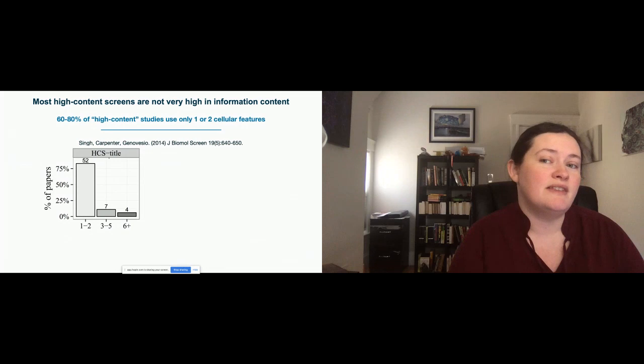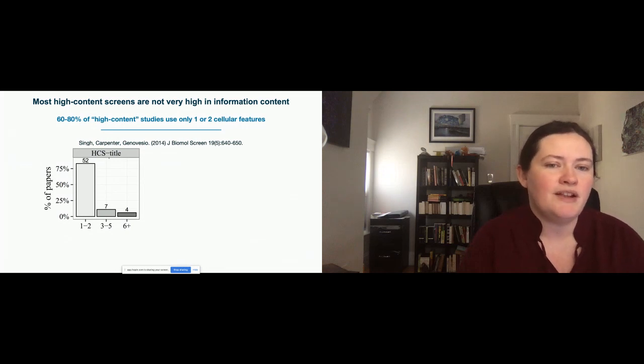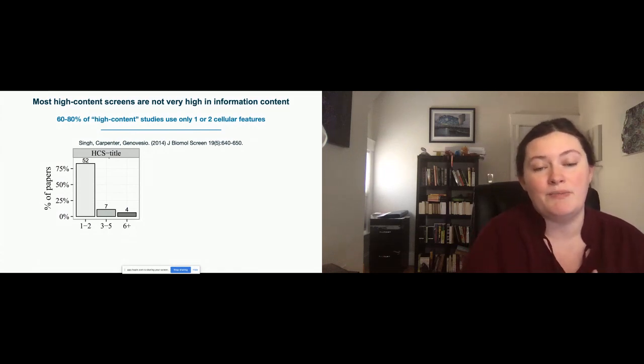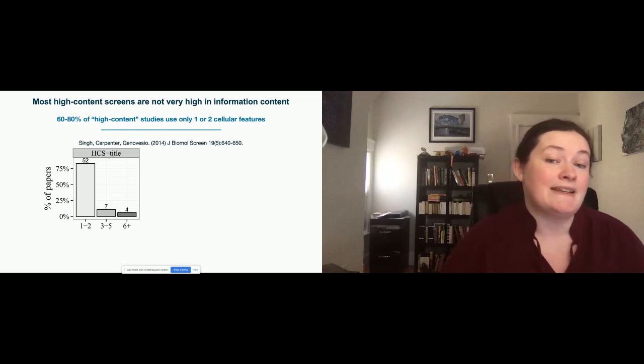Now, I've told you in this talk that you might have 4 million pixels in an image and you might have multiple channels. So we feel like using 1 or 2 measurements at a time, while it can be really valuable, and I'll show you an example of a project that we did using a single measurement, there's a lot of phenotypes that we think are out there that people haven't been taking full advantage of and where they're sort of leaving data on the table. And so we want to allow people who are using CellProfiler to get access to all of that data, even if they're not sure ahead of time that they need it.